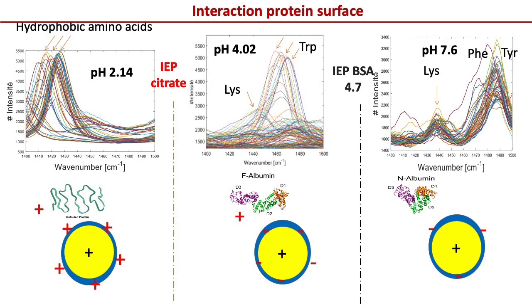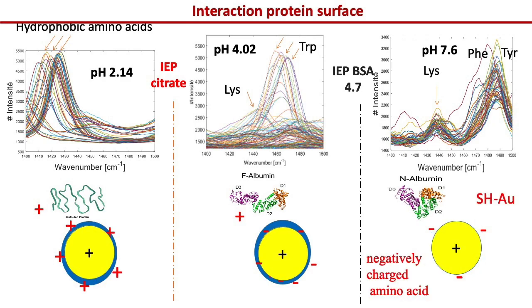Our gold nanoparticles were stabilized using citrate capping, colored here in blue. Citrate is negatively charged when the pH exceeds 4. Therefore, the native protein in heart shape will not be attracted by the citrate surfactant. Indeed, a substitution of the citrate by the BSA is assumed. The BSA at physiological pH is attached to gold using the thiol group and its most negatively charged amino acid.